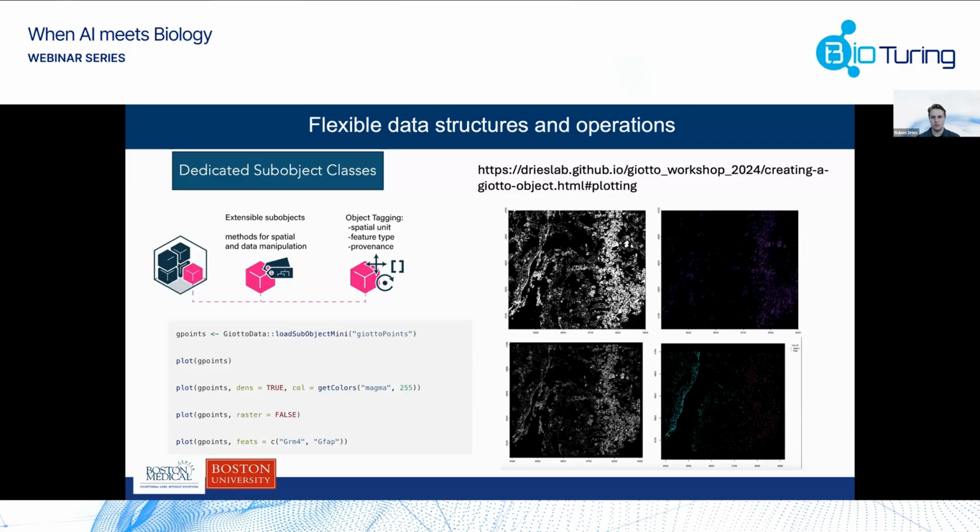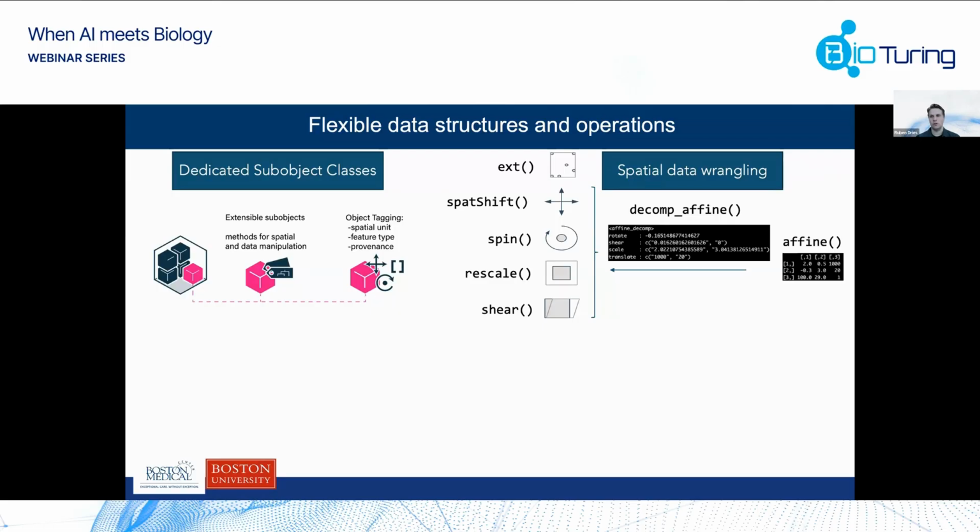Just to give an example, this is a really quick one where you show these Giotto points, and you can use these Giotto points independently. They don't necessarily have to be part of the larger Giotto object if you don't want them to be. If you just want to explore this real quickly, you can just look at the Giotto points and turn them around.